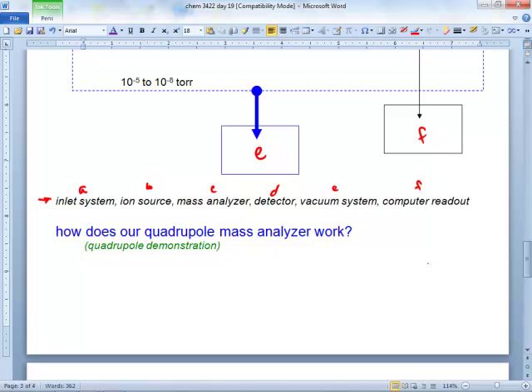They're going to apply what? Different combinations of voltages and magnetic fields in here. Pretty much just voltage is what it's playing around with, right? So that only a particular mass can get through, right? And it has to have a charge, otherwise the whole thing's not going to interact. So it only applies a certain energy for something to get through. Okay, so that's what Emily's doing.